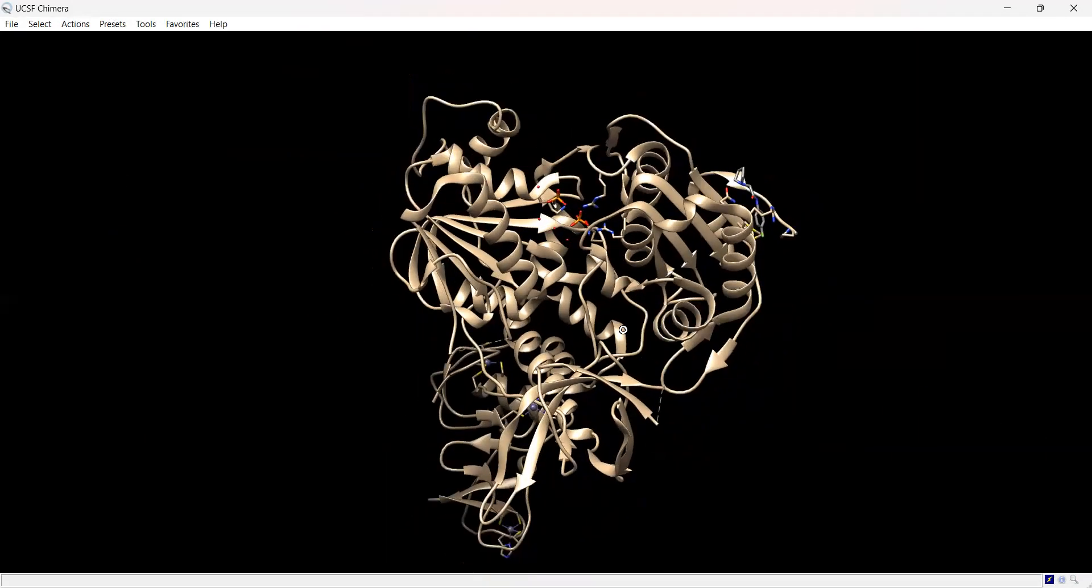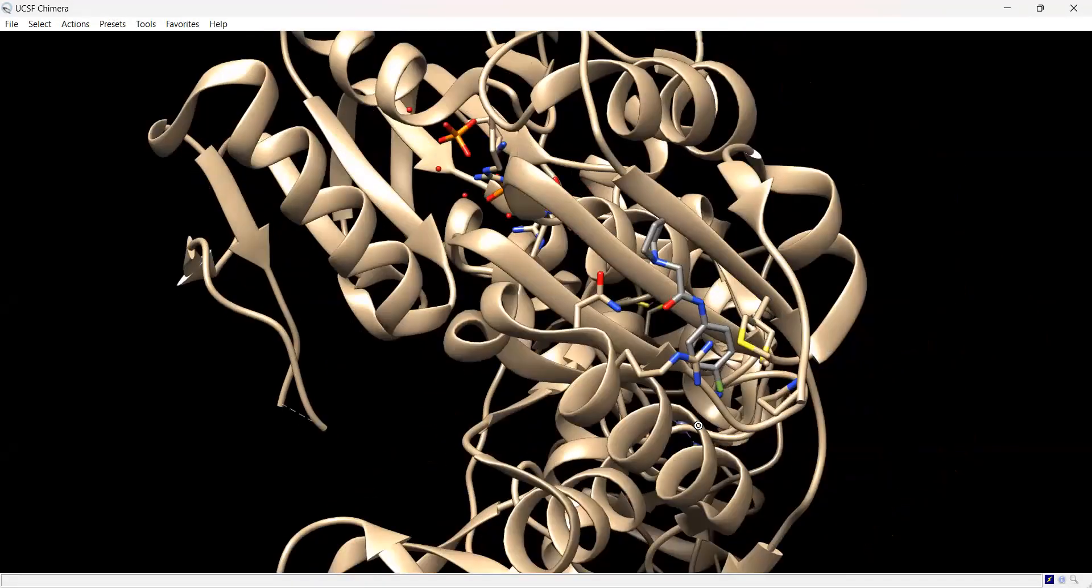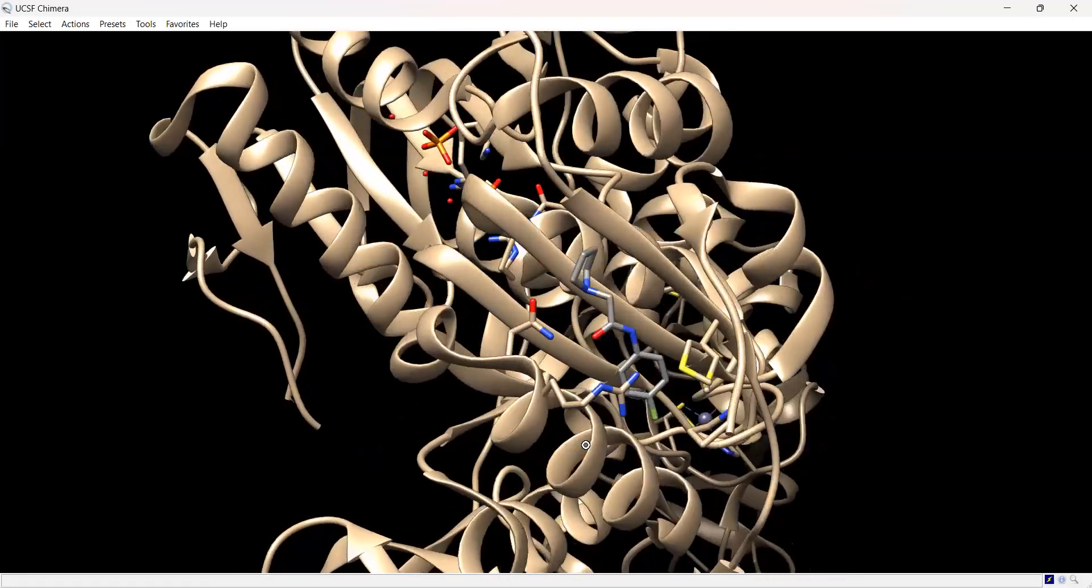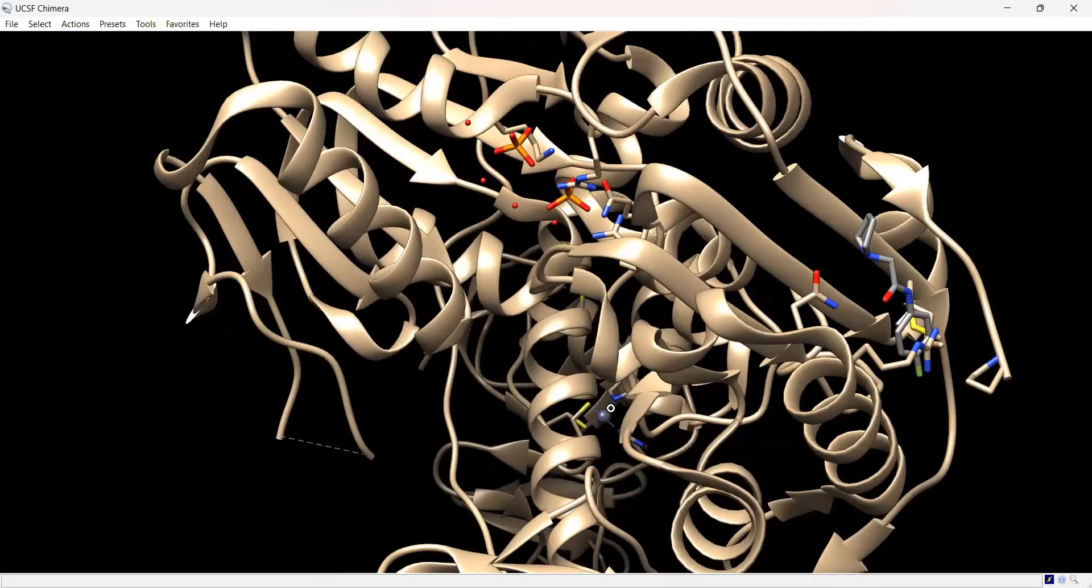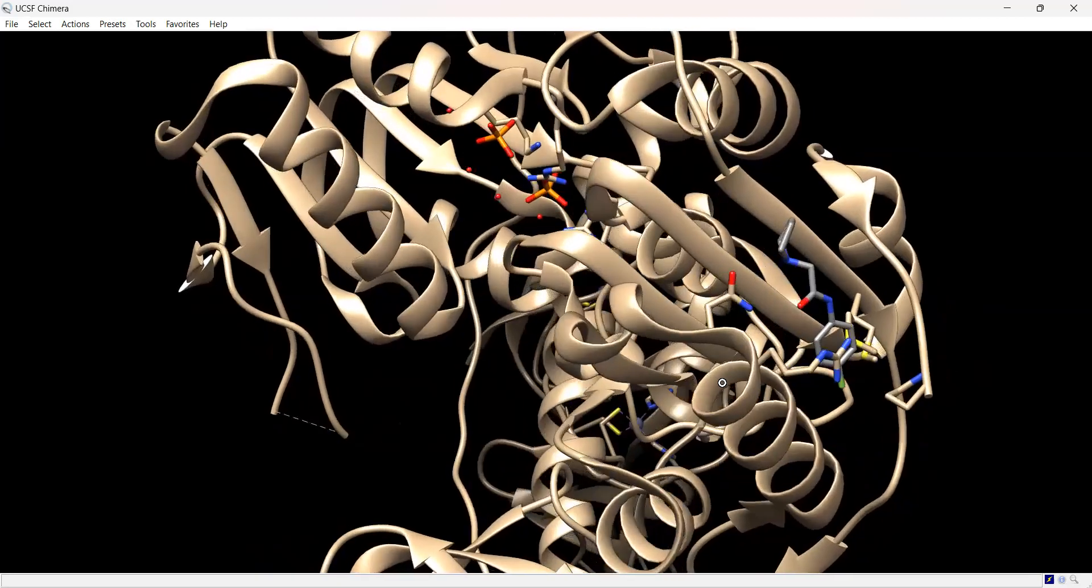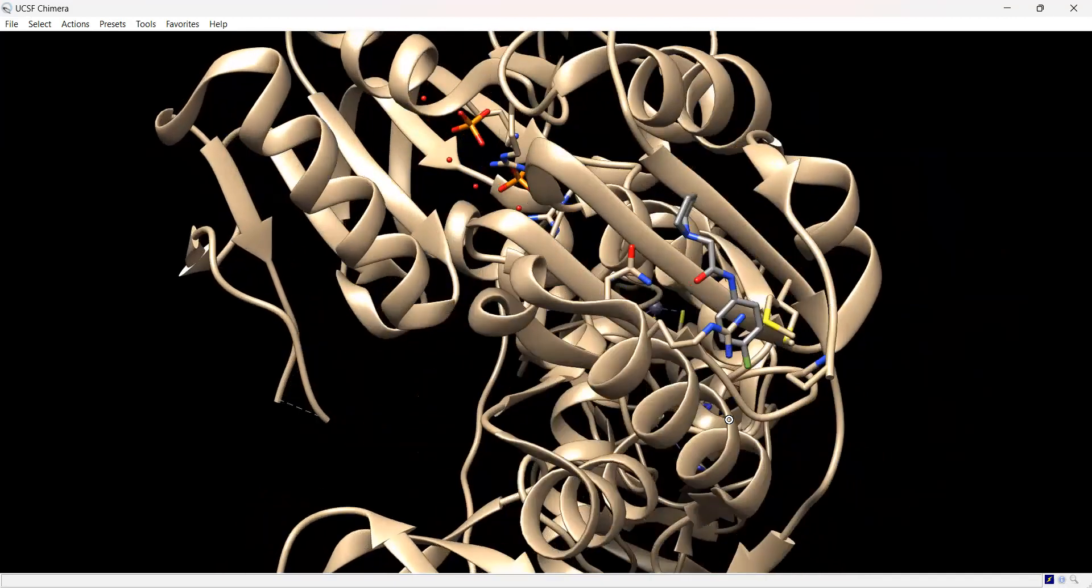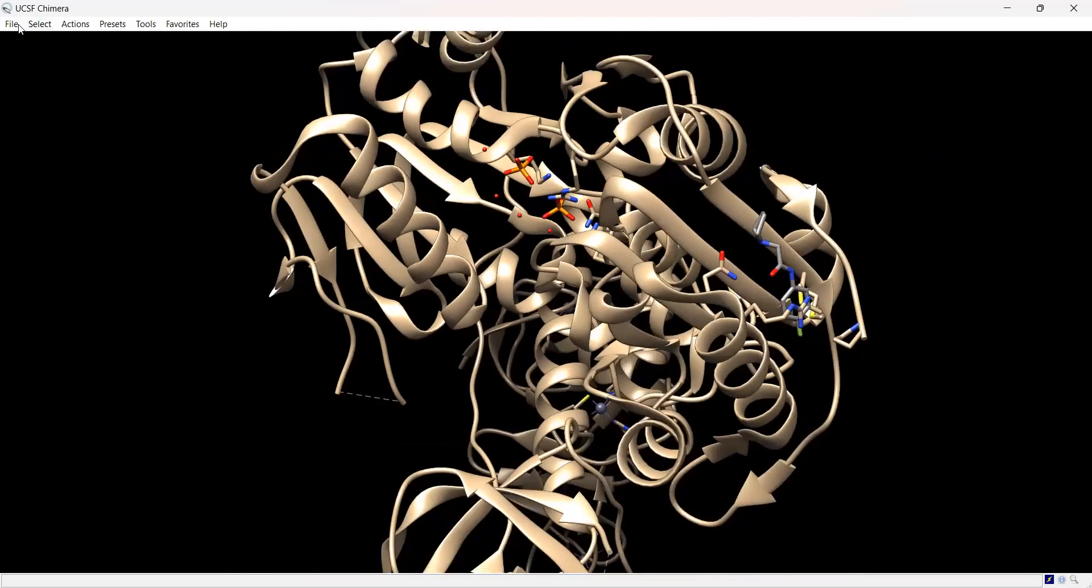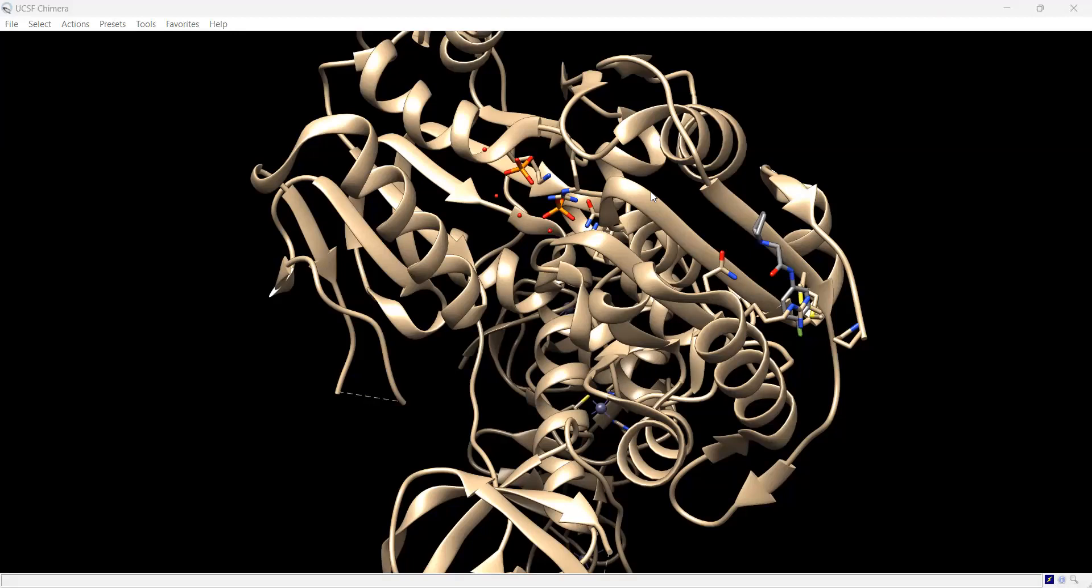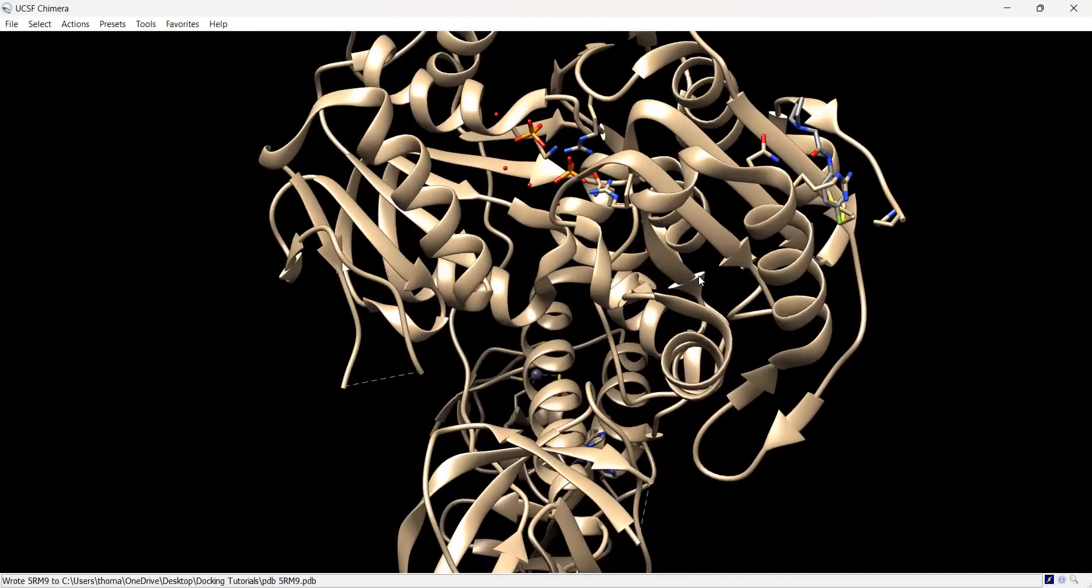Now we want to study the interactions binding this fragment. Obviously this is a low molecular weight fragment, so the binding interactions are assumed to be not too strong, and indeed that is the case. However, there are some interactions holding that fragment bound to the protein, and we want to know what those are for our docking studies going forward. First, I'm going to save this as a new PDB file. You'll want to create a folder for all your docking. I'm saving this as PDB 5RM9.